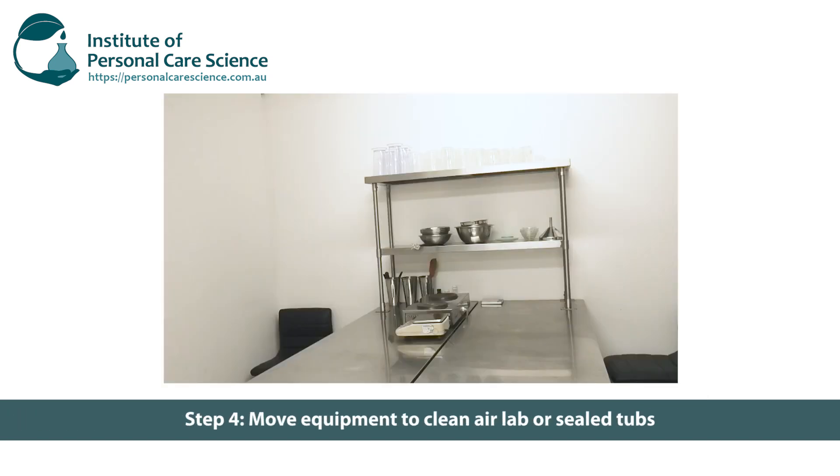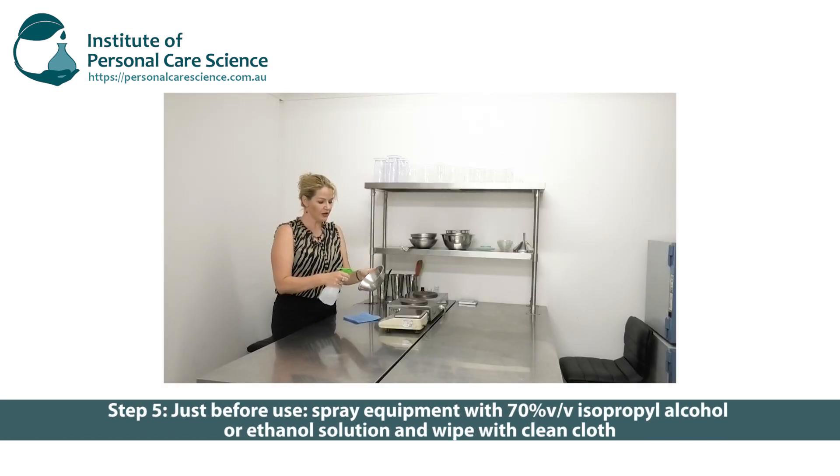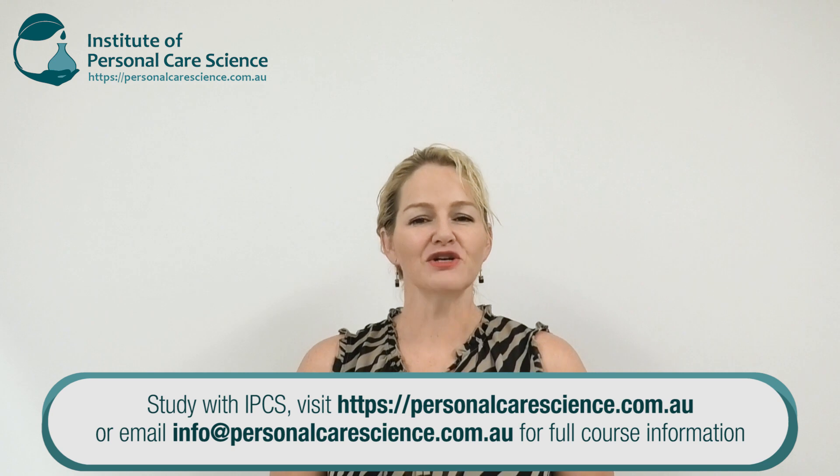Step four: once air dry, move that equipment into an almost sterile environment — like a clean air lab environment, as you saw me do. If you're not going to be using the equipment for some time, or if it's a high traffic area or you're not sure about the cleanliness of the environment, store your equipment in sealable tubs. Step five: spray your equipment with 70% isopropyl alcohol or ethanol solution just before use and wipe with a clean cloth. The excess alcohol will evaporate quickly, leaving your equipment clean and ready to use. That's how to clean your lab equipment effectively to make sure it's always ready to use and won't contaminate your products.